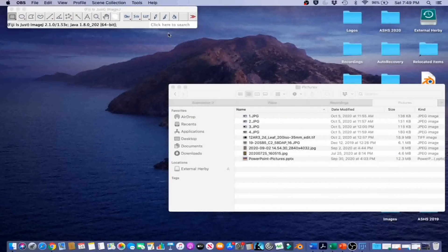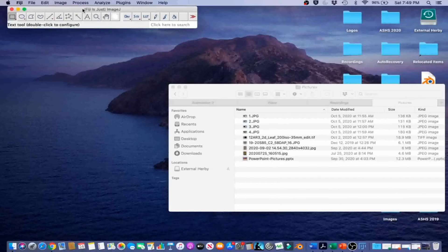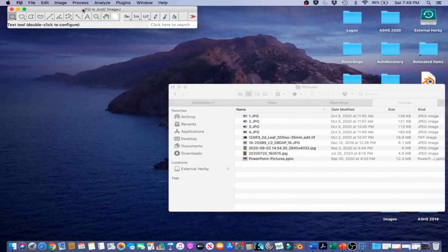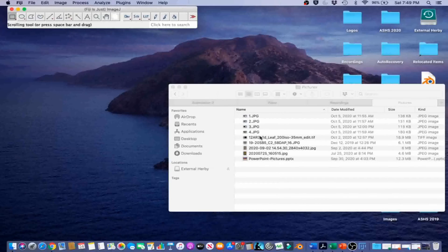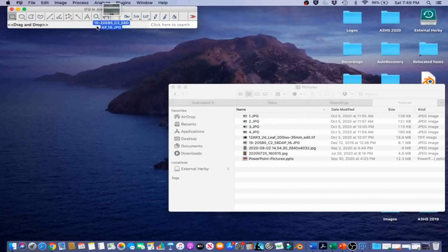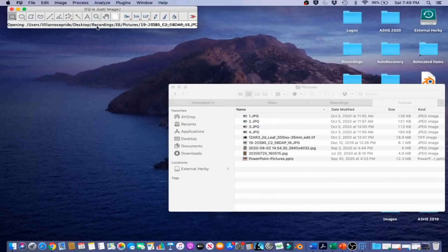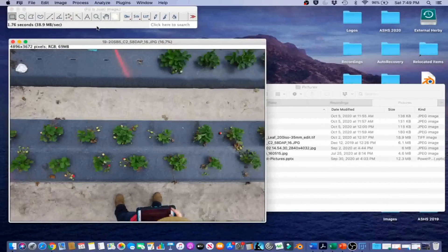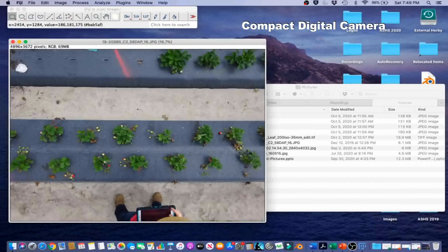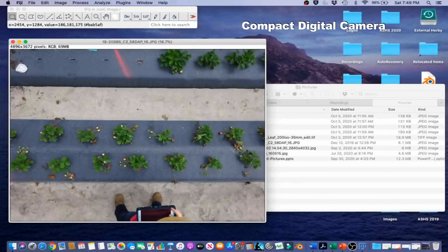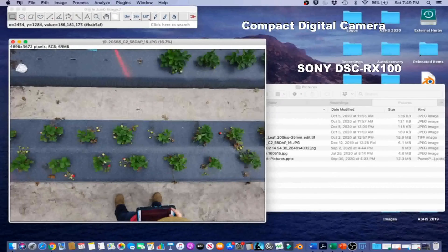For this example, we're going to use the Fiji version of ImageJ to count the number of strawberry fruits and flowers in a photograph of strawberry plants in the field. You will import the image by dragging the image onto the ImageJ graphical user interface. This photograph was taken using a compact digital camera, in this case a Sony DSC RX100, in the middle of a cloudy day.